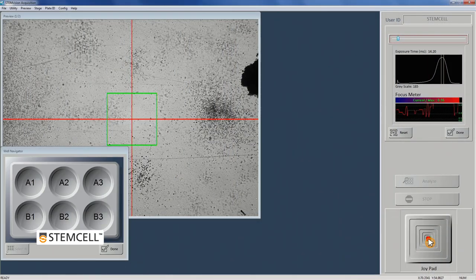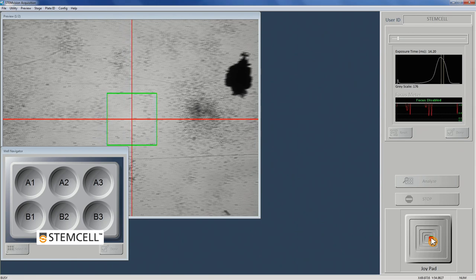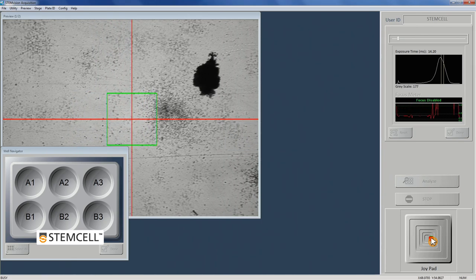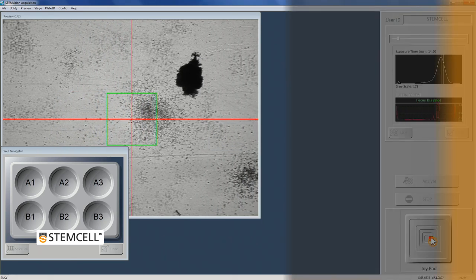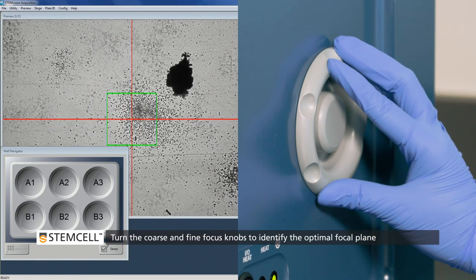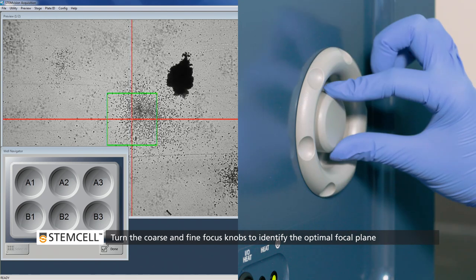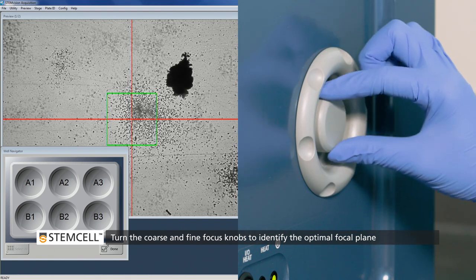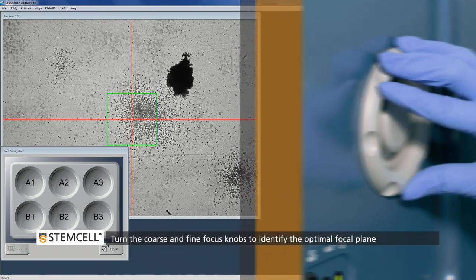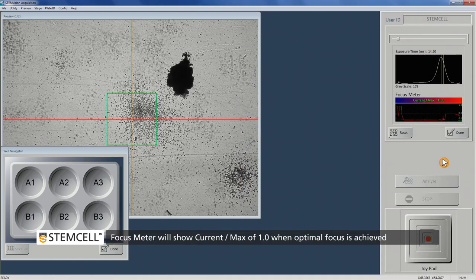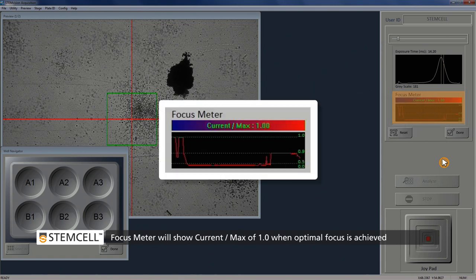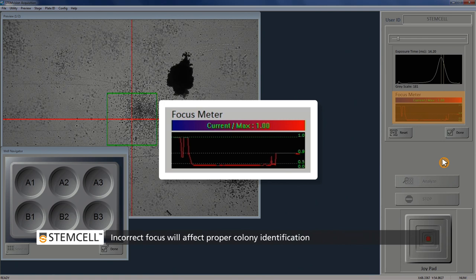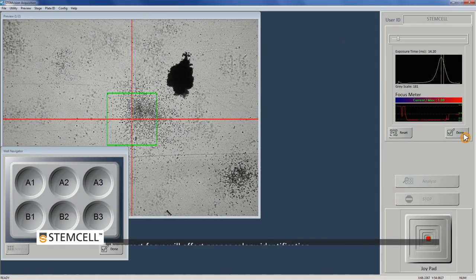Use the joypad to find a location in the well with a dispersed colony inside the green focus area box. Turn either the coarse or fine focus knobs to let the acquisition application identify the optimal focal plane. Once the optimal focal plane has been identified, the focus meter will show a current over max of 1.0. The further away this value is from 1.0, the poorer the instrument's focus. Click Done.